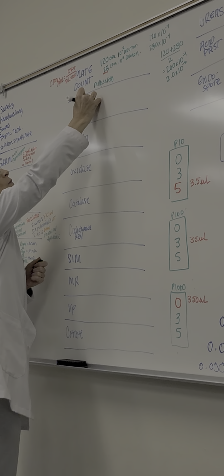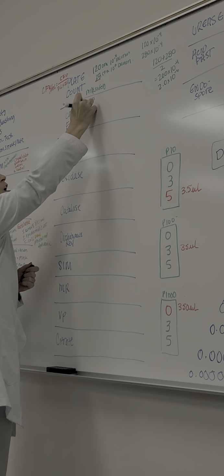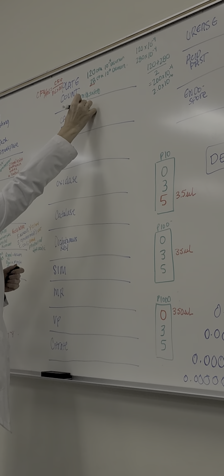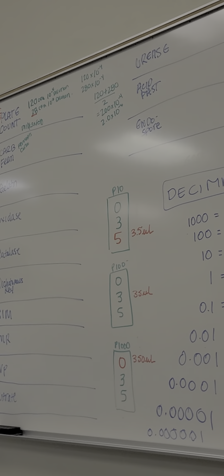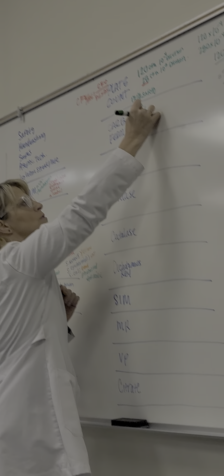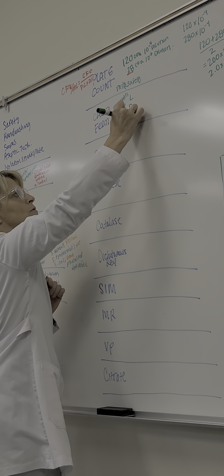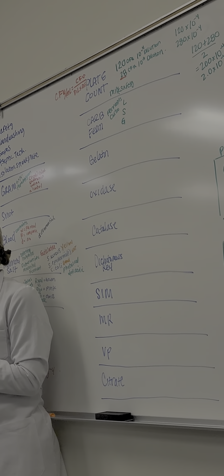If it ferments carbohydrates, you get the point. It ferments carbohydrates. What were our 3 carbohydrates? Lactose, sucrose, glucose. So we had lactose, sucrose, glucose. What else did we have in the tube?